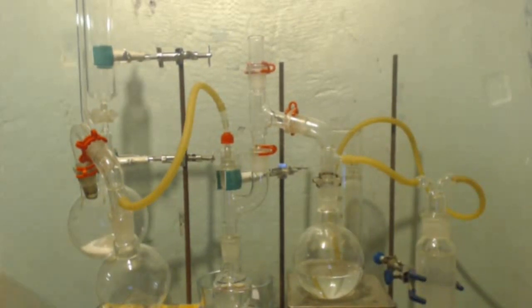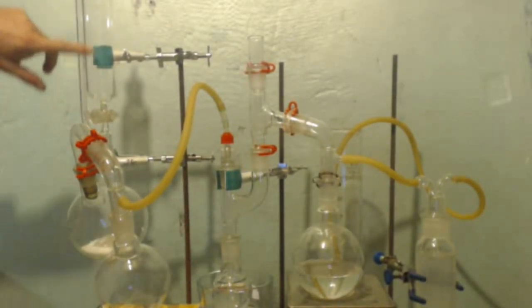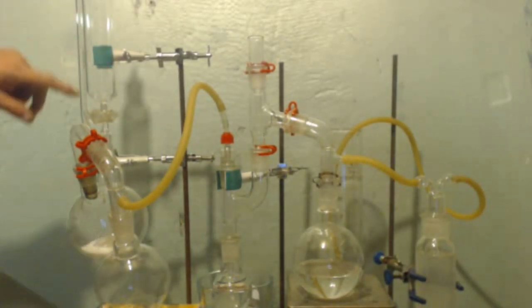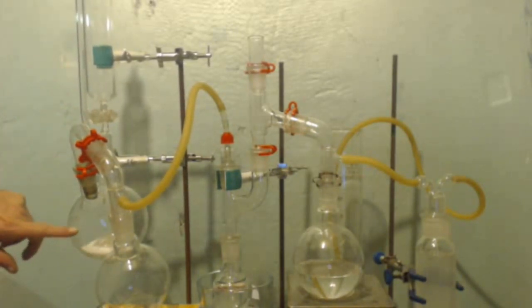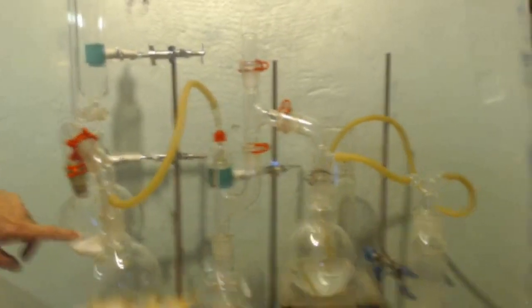Alright, I don't want the camera on while I'm starting this, so I'm going to show the apparatus first. You can see right here where my finger is, right? That's where the 97.44 milliliters of sulfuric acid is. Then it drips down into this bottle here, and there's salt in here, right? And once it goes out of the salt, it comes up here. It's just a glass tubing.